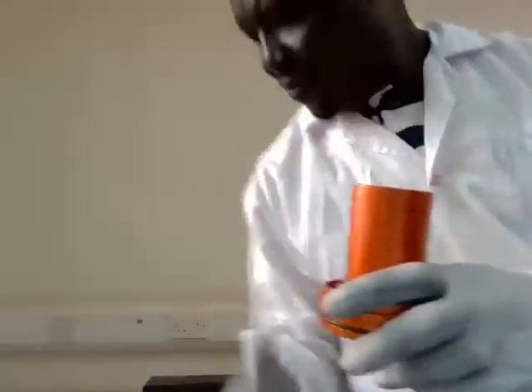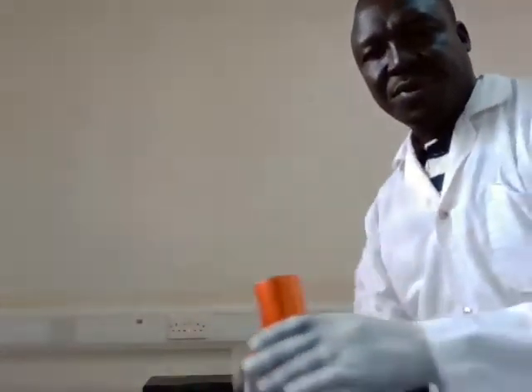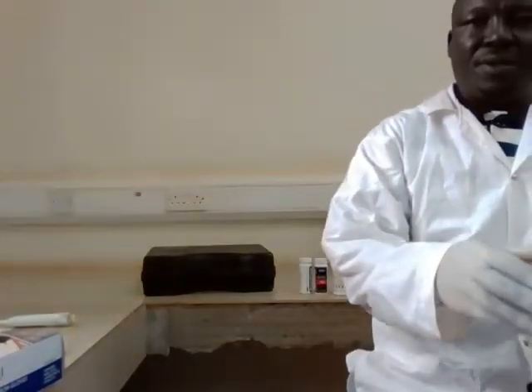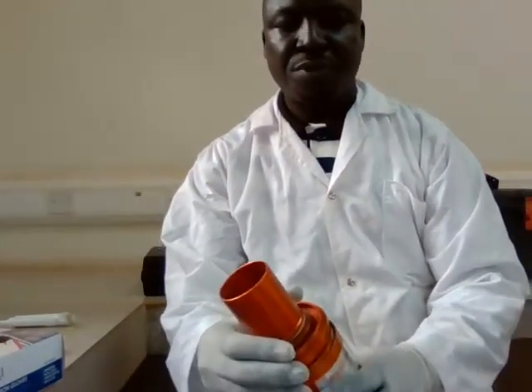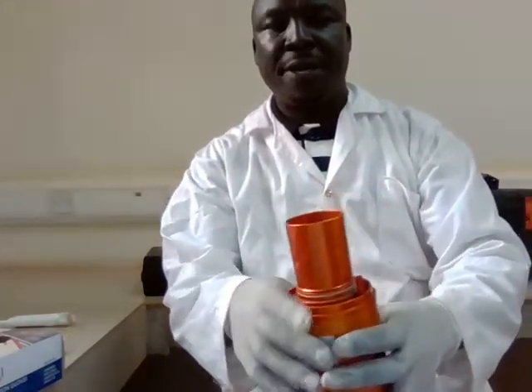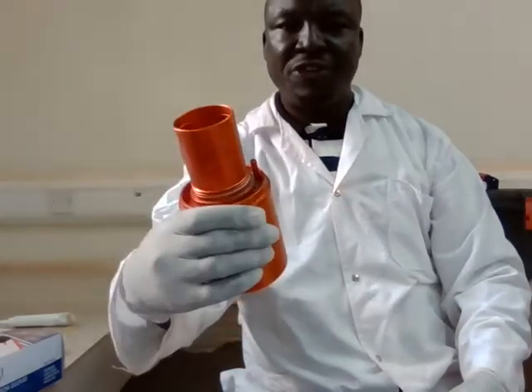So I'm just going to show you how you are going to do membrane filtration. This is the membrane filtration unit.